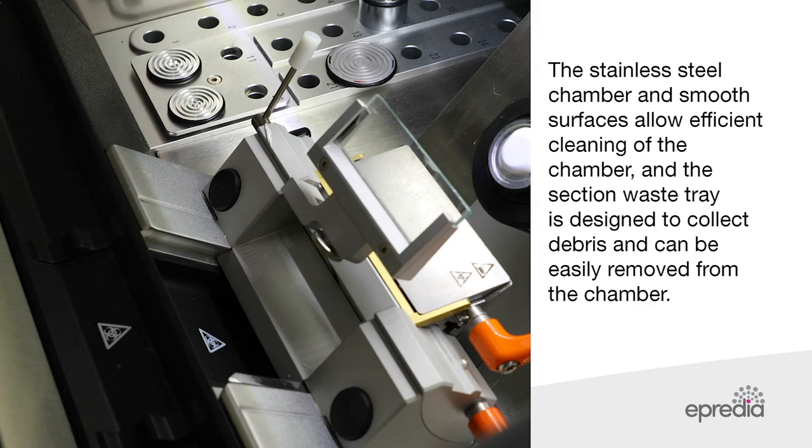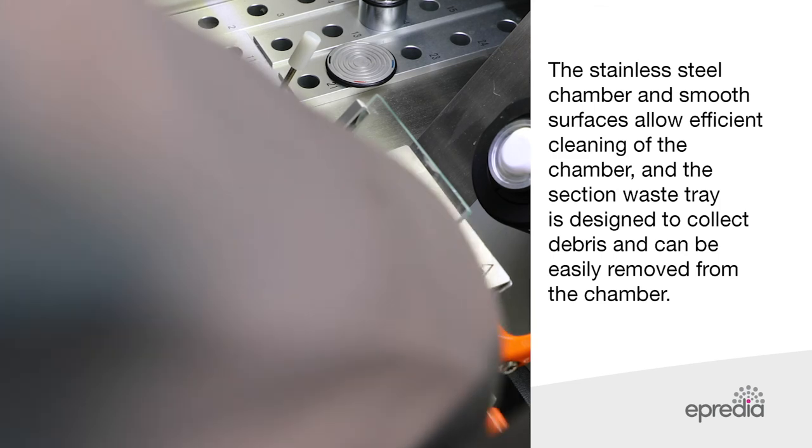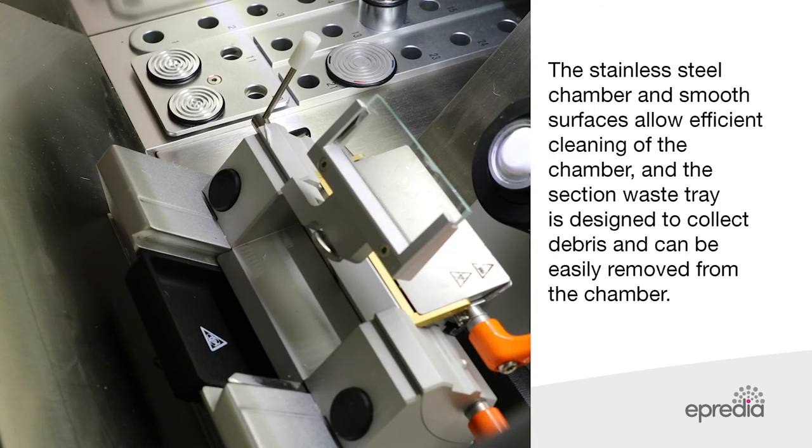The stainless steel chamber and smooth surfaces allow efficient cleaning of the chamber. The section waste tray is designed to collect debris and can be easily removed from the chamber.